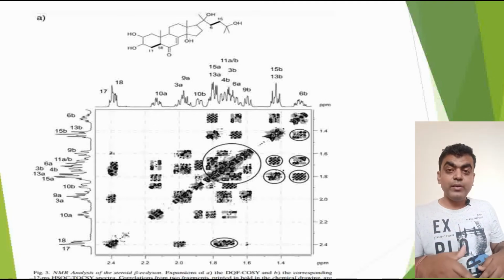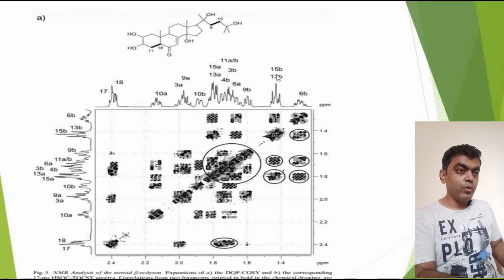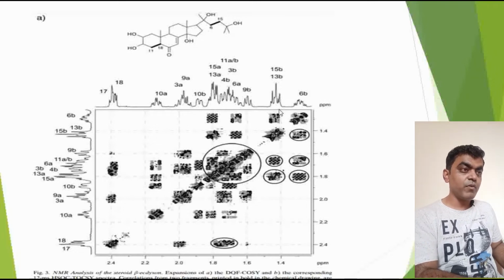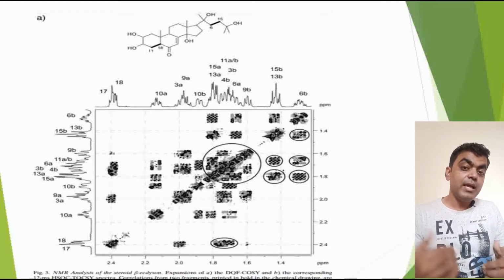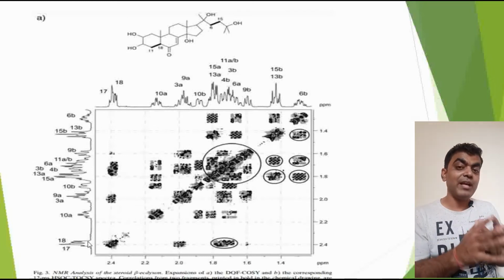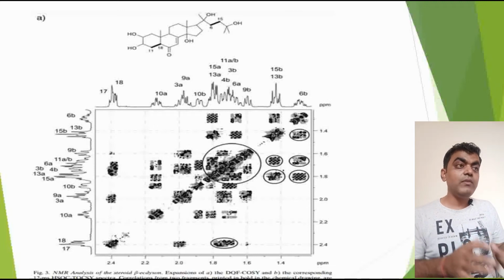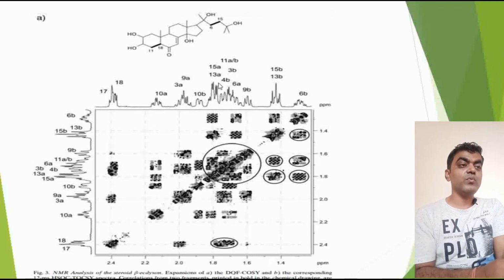So when you do a 2D, suppose I have one peak position here and the same compound also gives a peak position here. When I try to correlate, it should correlate with all the peaks. All the peaks of a particular compound will correlate with all the peaks in the cross peaks as well as with the other peaks in the heteronuclear dimension. So if it is another spectrum, it should match with all the peaks, and only then can we confirm that these are cross peaks and this is the structure I am getting.